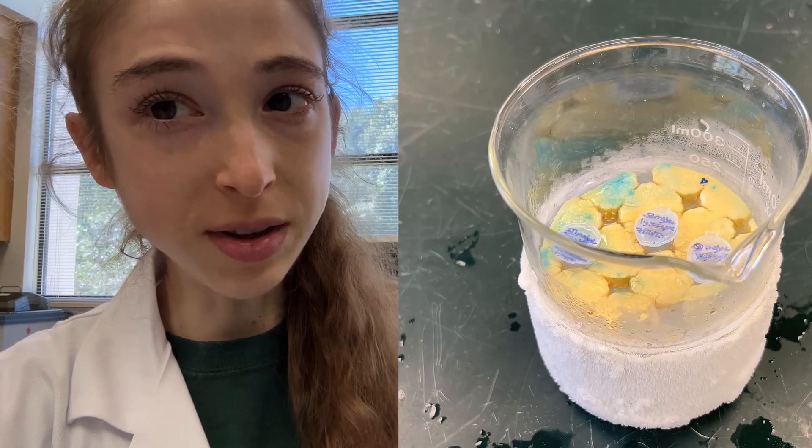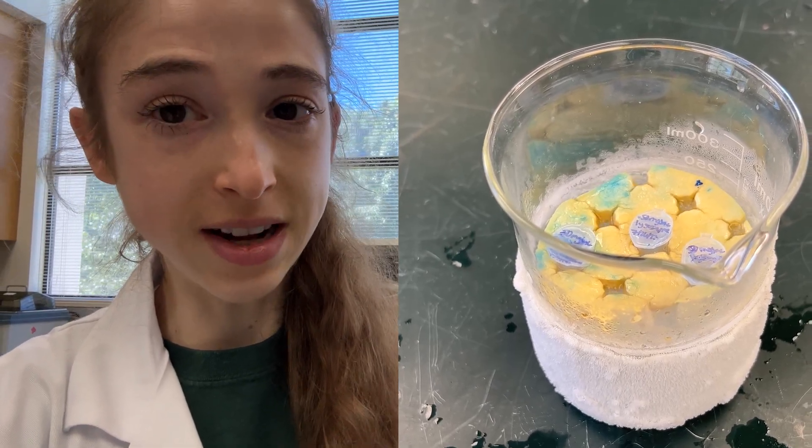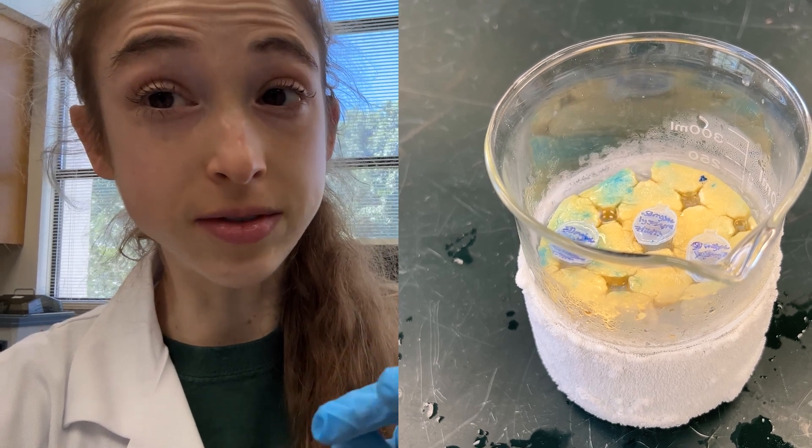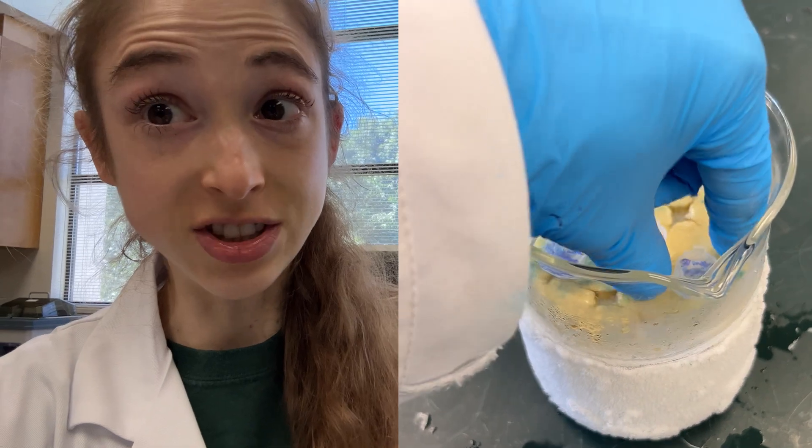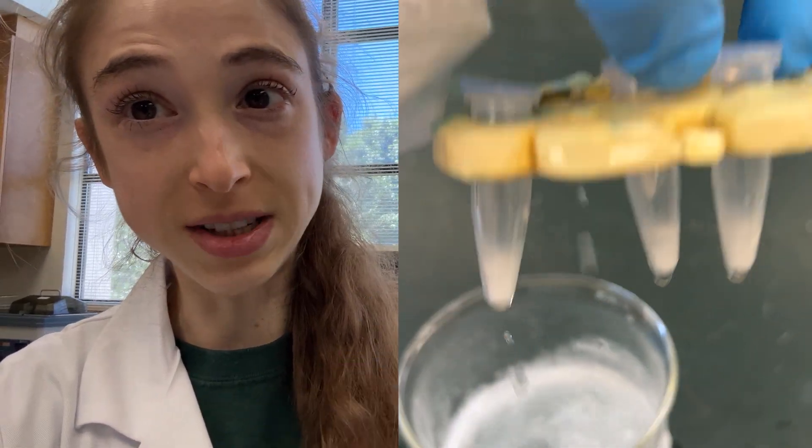Also be careful with your labeling, because these alcohols can take off Sharpie ink. Use a solvent-resistant marker, or at least write on the top of the tube or the part that's not actually going to go into the solvent solution.